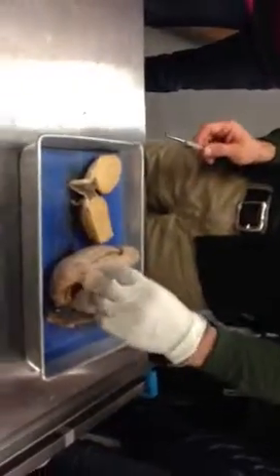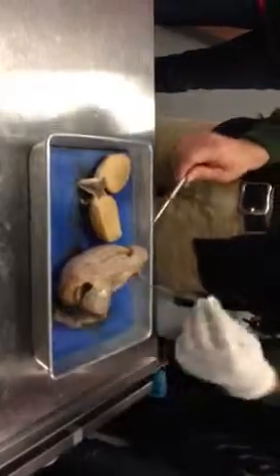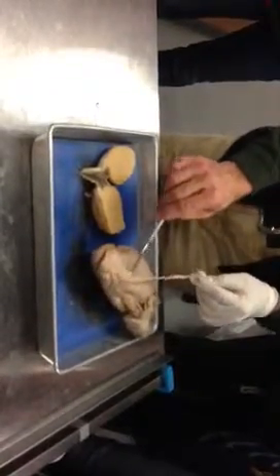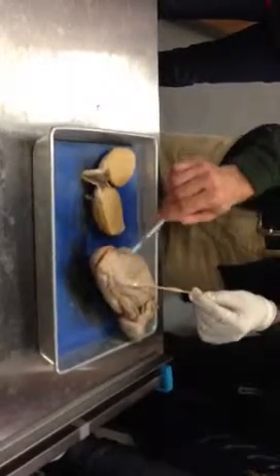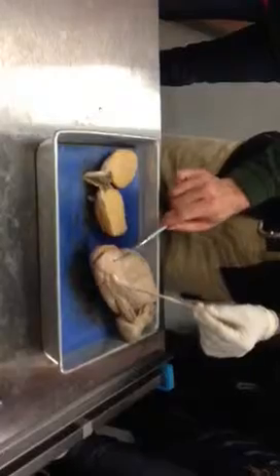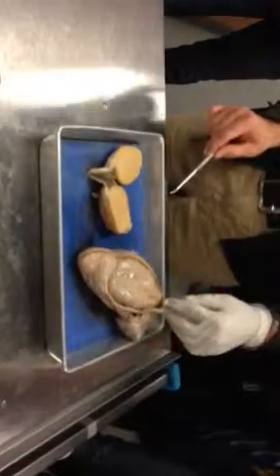Again, the vas deferens is this tubule, which has been dissected away from the spermatic cord, really would be part of it. And we can see that the vas deferens, just like we learned in lecture, comes off of the tail of the epididymis. So the sperm are all stored in here, and then at ejaculation, the sperm are propelled up through this tubule, the vas deferens.